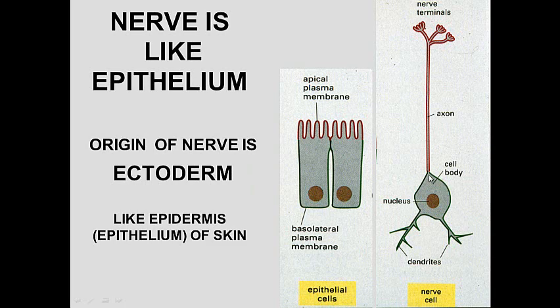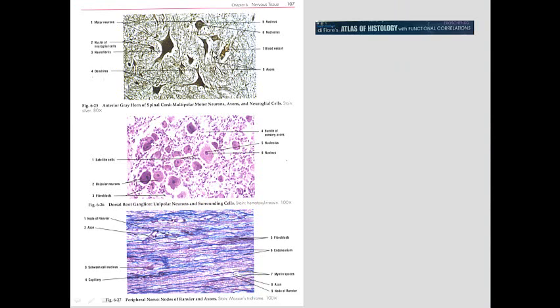So we have the cell body, the nucleus, dendrites, and axons, and then nerve terminals at the end. In the spinal cord we have neuron cell bodies and lots of axons coming through. In various organs we have ganglia — this is a dorsal root ganglia, but we do have ganglia in different organs as well. The long projections are the axons, most of which are myelinated axons.